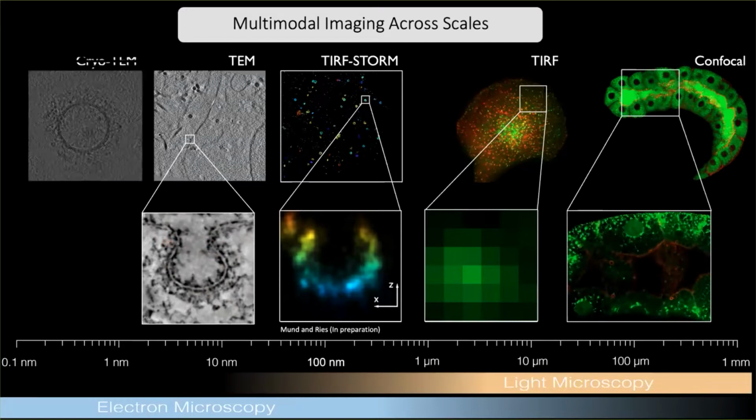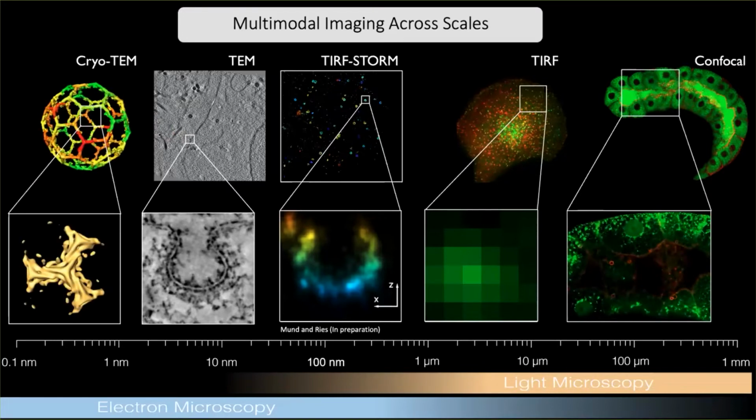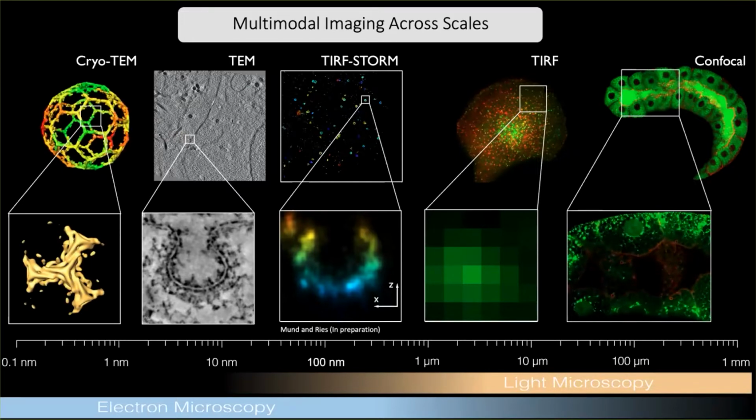And finally, if we go in the direction of cryo-electron microscopy and tomography, the compromise here, I would say, is on the contrast that one would get, because we don't use any staining whatsoever. All the structural information in the sample is intact, and by using averaging, we can even obtain structural information about the organization.